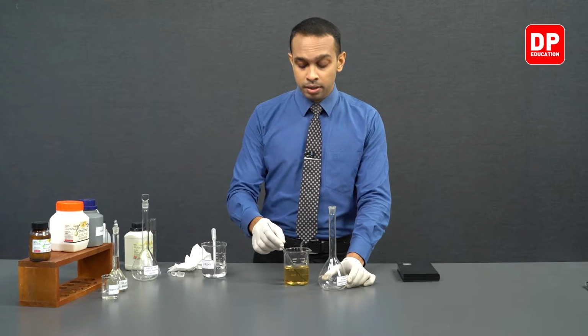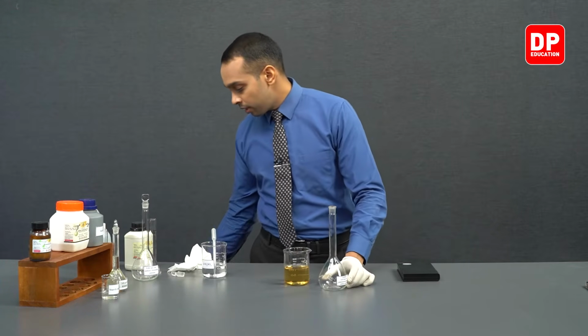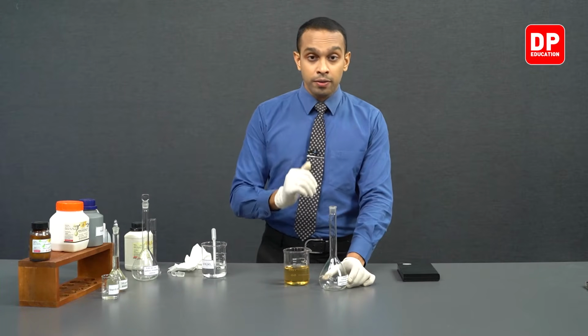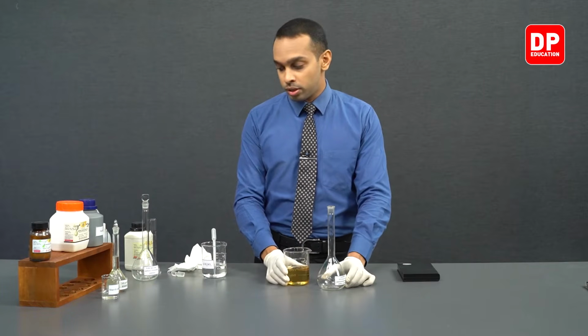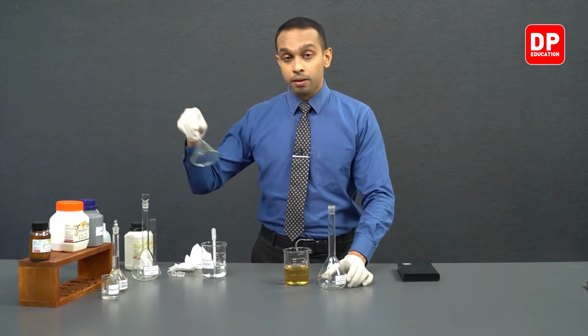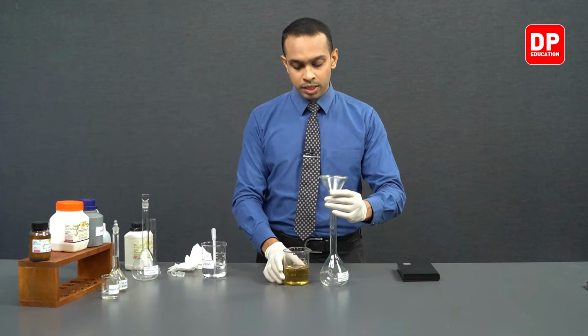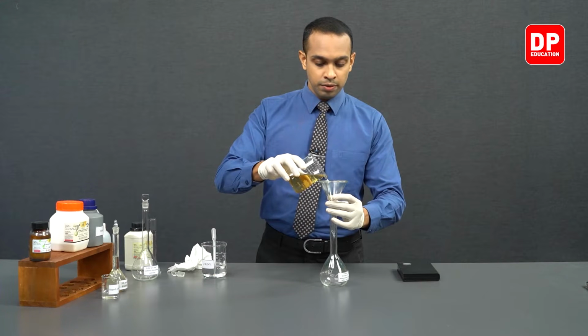You shouldn't forget the fact that we prepared this by dissolving the ammonium ferric sulfate solid in 1 mole per decimeter cubed sulfuric acid. So now we are going to transfer this into our 250 milliliter volumetric flask.